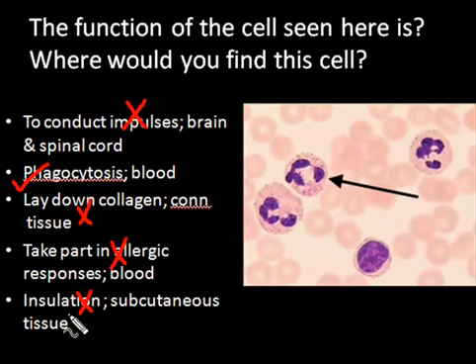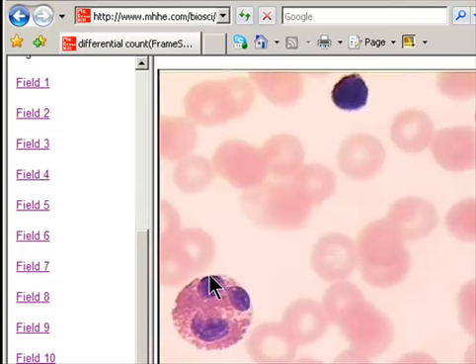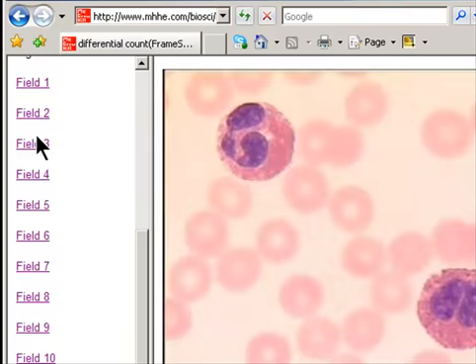So let me show you an image of, so here's an eosinophil. So here you can see an eosinophil, very different. It has lobed nuclei, but you can see that the granules are so distinct and they're pink in color. Here's another one where you can see this. So this is again a website you are required to go to. So it's very, very important for you to look at these images frequently, so that you can then identify what the correct choice would be.